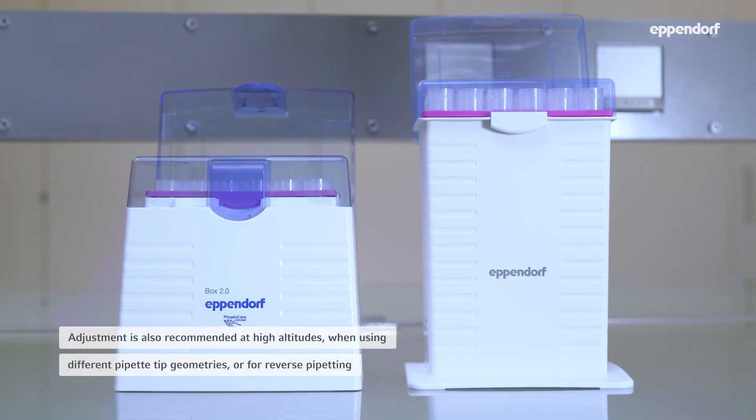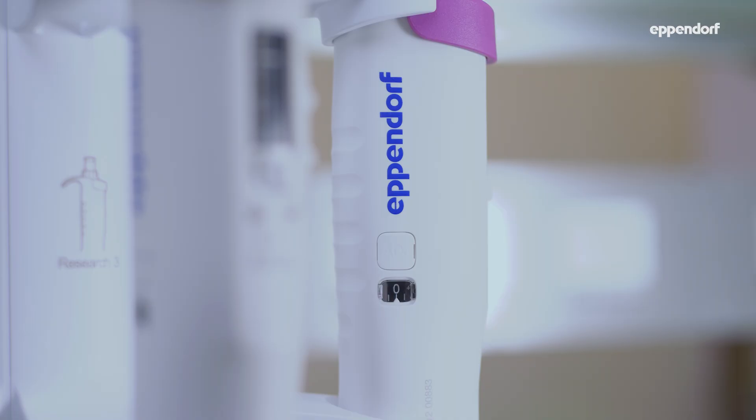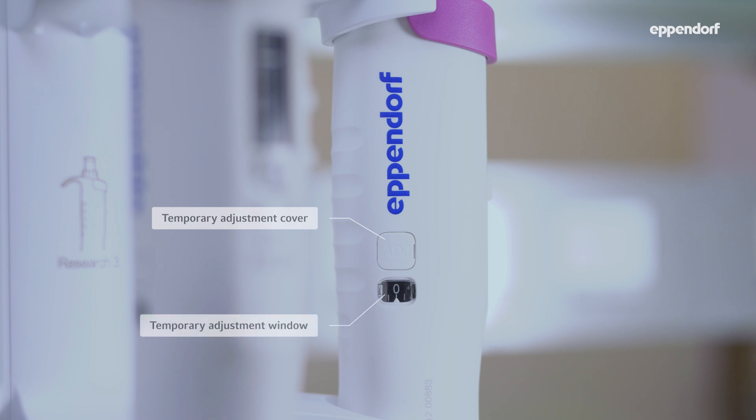Adjusting the pipette is also recommended when using it at high altitudes or with elongated tips. The temporary adjustment changes the volume that the pipette aspirates and dispenses to compensate for the effects of liquid properties or air pressure. It can easily be reset to the manufacturer's calibration.